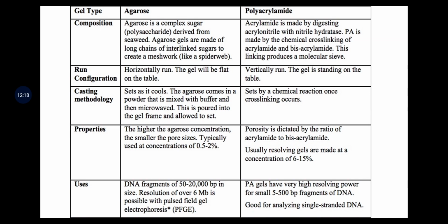Casting methodology of agarose: it sets as it cools. Agarose comes in powder that is mixed with buffer and then microwaved. This is poured into the gel frame and allowed to set. Polyacrylamide is set by chemical reaction once cross-linking occurs.